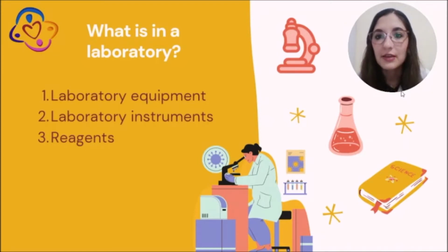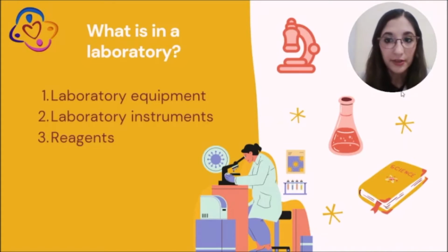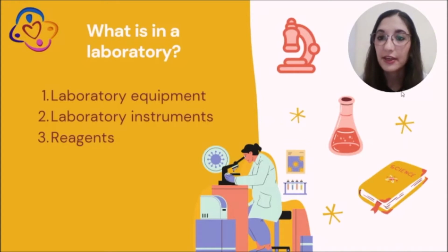And for example, we can also have an incubator, which is this machine where we can keep our microorganisms so they can grow, alright? The equipment are most of the times the big machines that we have in a lab that we cannot move from their place, alright?